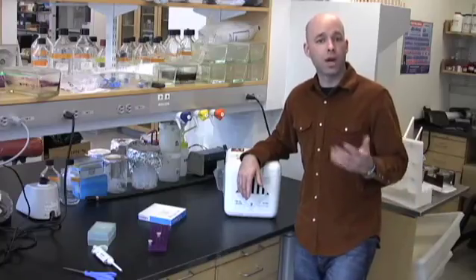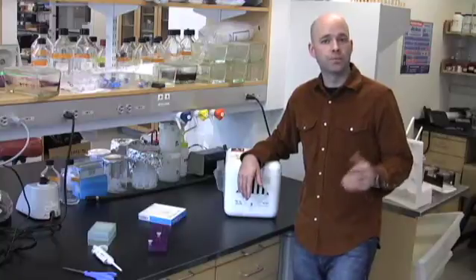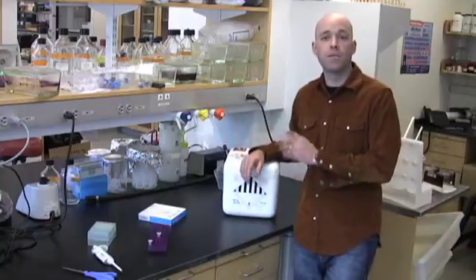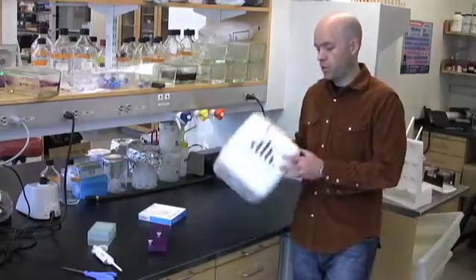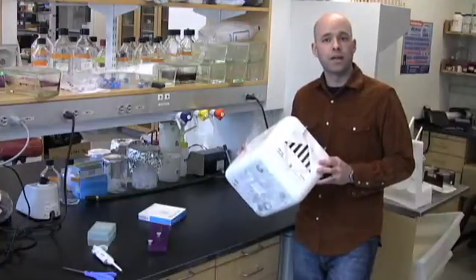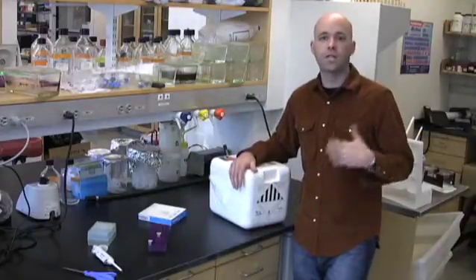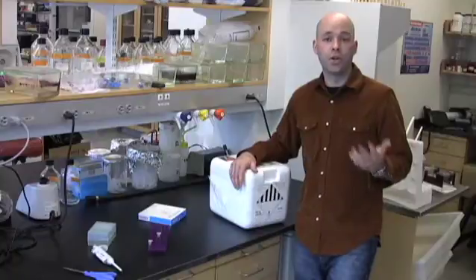There will almost certainly come a time in your project or your career where you need to mail a DNA construct to a collaborator. Now currently this involves taking an epitube, putting it into some dry ice in a big styrofoam box. And the problem with this is that in addition to it actually being expensive to mail this thing, you have to then deal with a FedEx account or a DHL account, and it's just another hurdle you don't need.